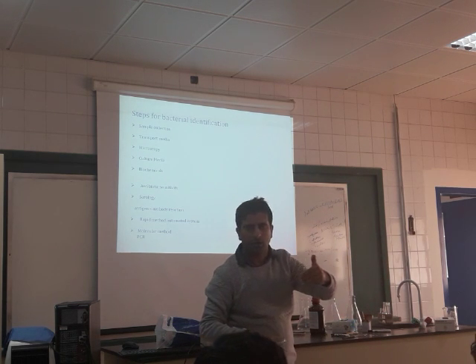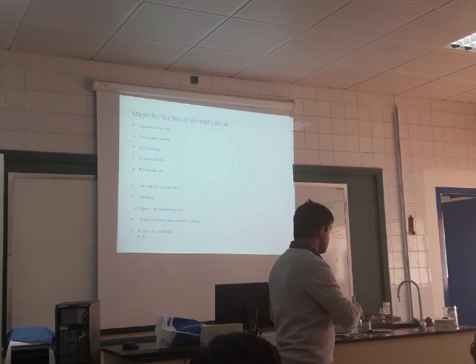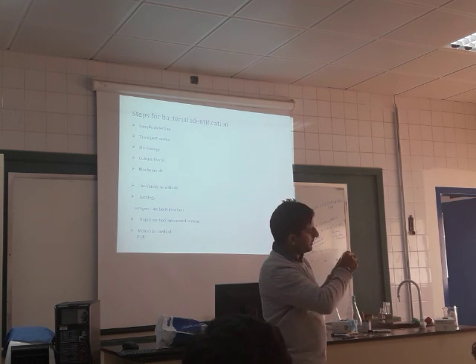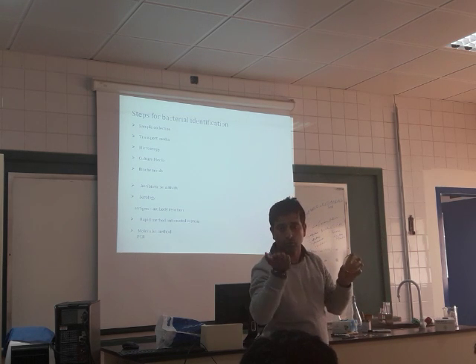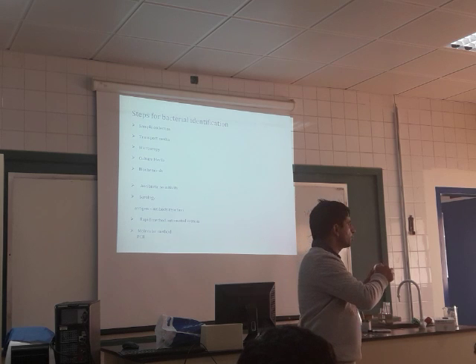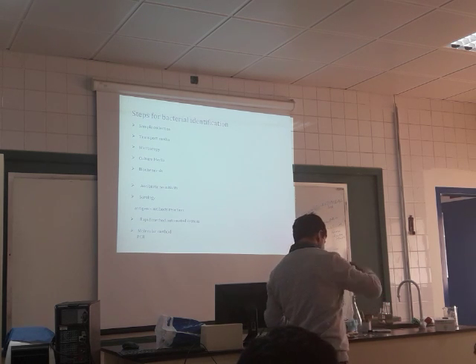Next morning, either after 12 or 24 hours, when you see this, if the antibiotic is sensitive, there will be a clear zone, no growth at all; it will not allow the microorganism to grow. If it is resistant, there will be growth of the microbe. So this is called the antibiotic test.